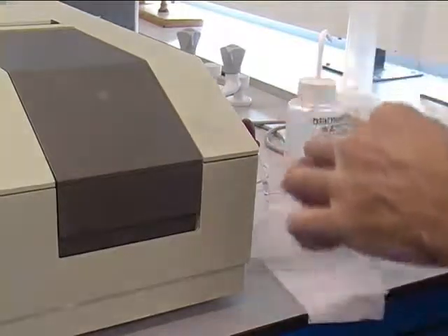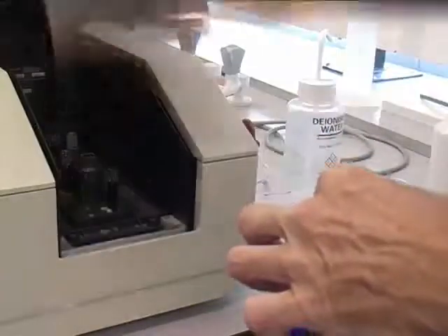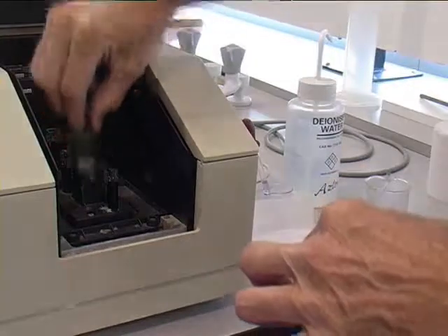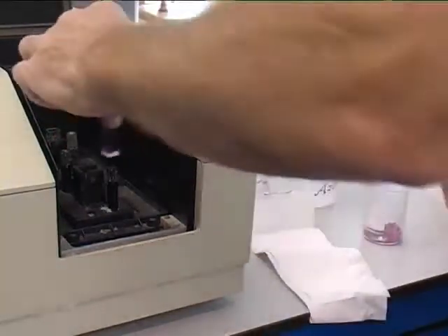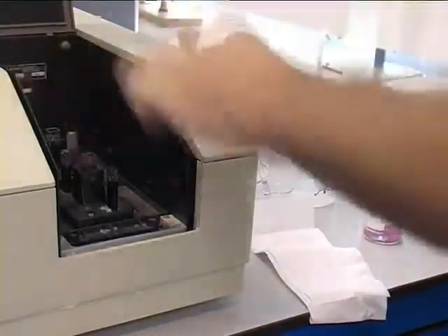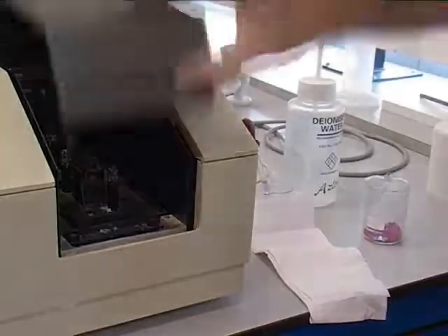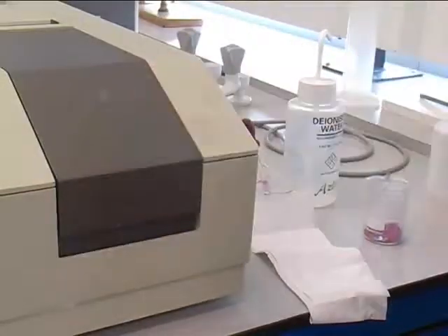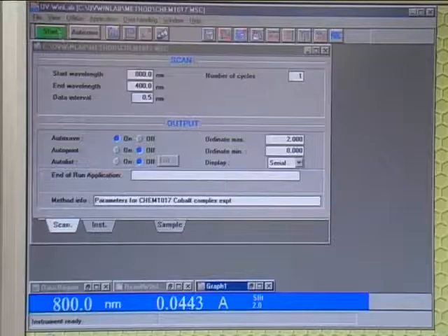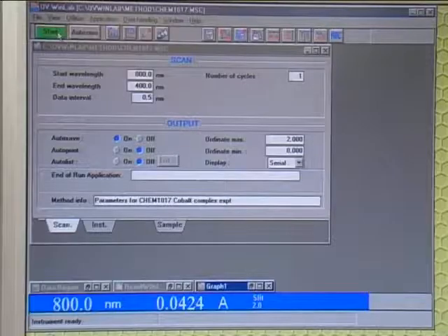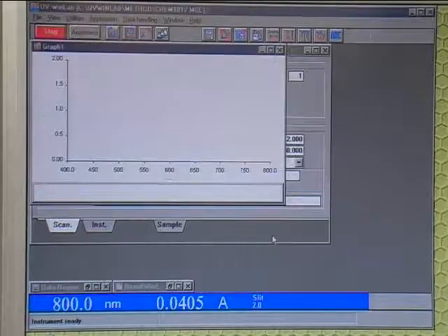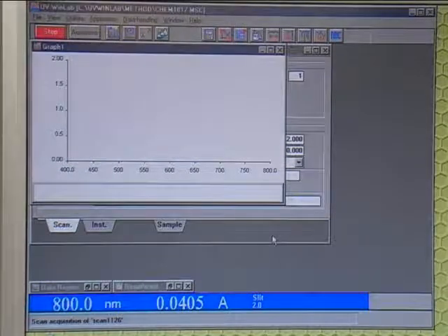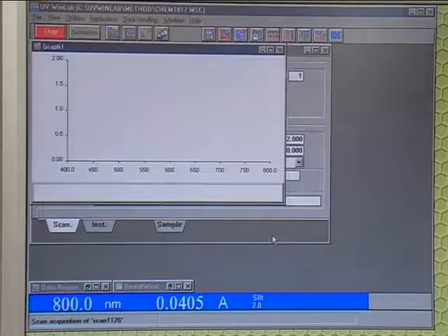Wipe the cuvette down to make sure there are no finger marks, and place the cuvette into the first hole in the UV-Vis spectrometer, still leaving one blank cuvette in the second hole. Now click Start to run the program, and this will acquire your data for you.